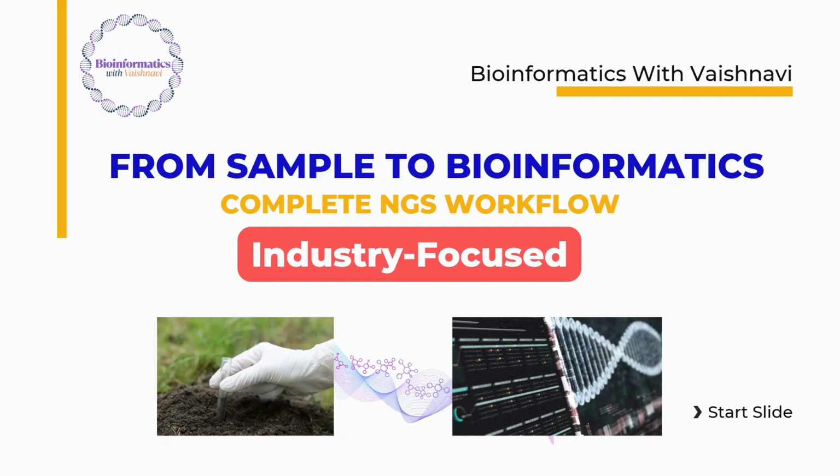Many biotechnology and life science students learn NGS, wet lab techniques, and bioinformatics separately, but often feel confused about how everything connects in real life. In this video, I will explain a complete NGS workflow starting from a biological sample and ending with bioinformatics data analysis in a simple step-by-step way. This video will be completely industry focused. This will help you in learning and preparing for your job interviews also. This video will give you a big picture of how sequencing projects actually work.